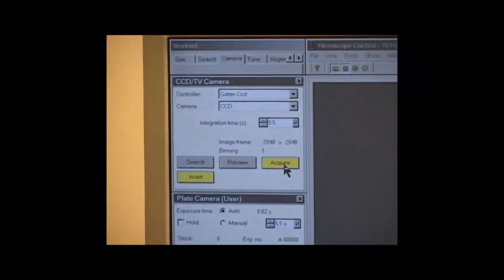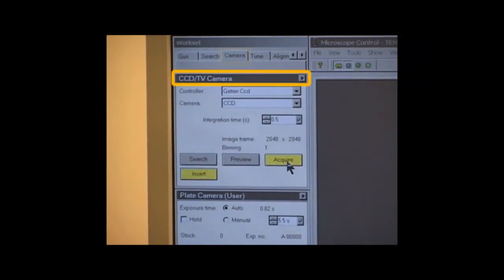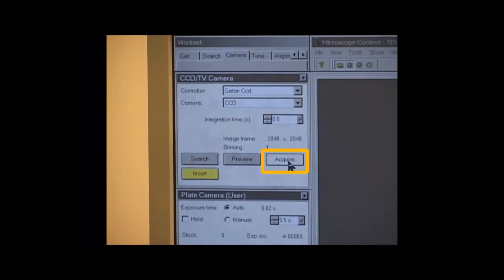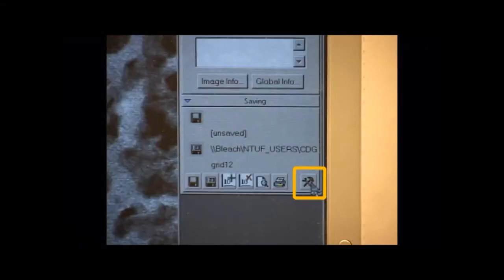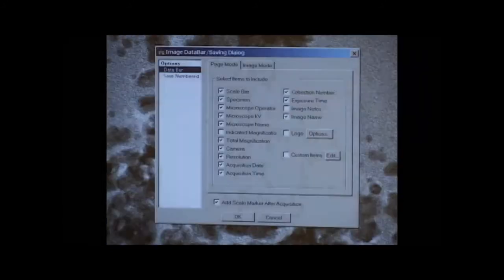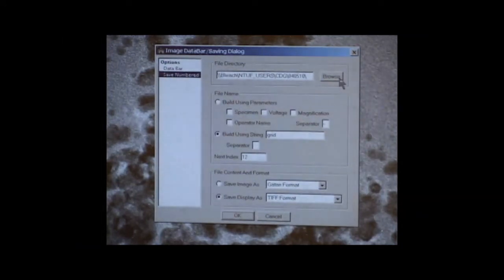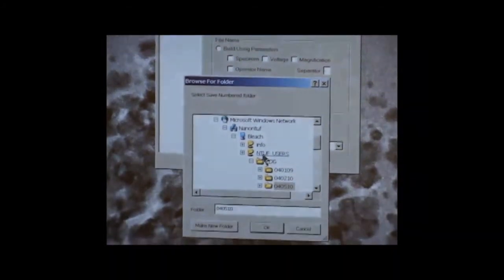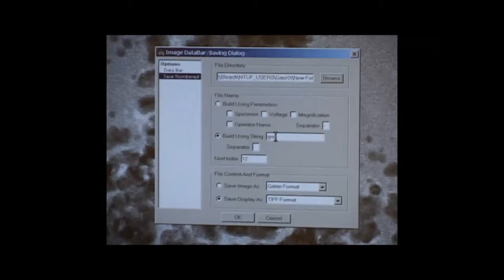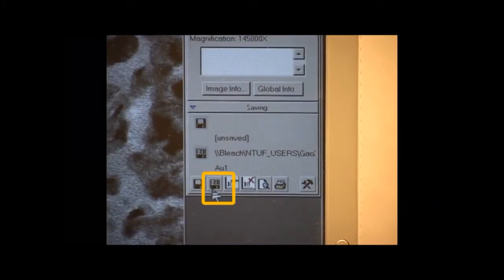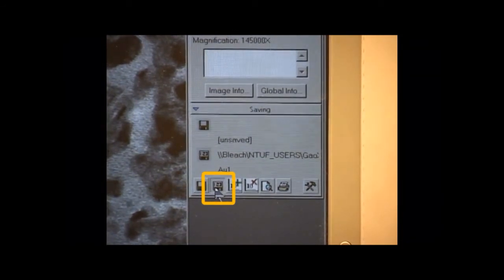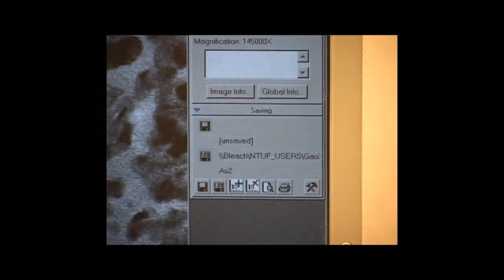Go back to the Microscope Control Software, Camera tab, CCD slash TV, and click Acquire. To save the image in the Digital Microscope, click the tool icon in the lower right. This brings up a new window. Select Save Numbered. Click Browse. Select NTUF Users. Select your folder. In the dialog, select Build Using String, and type in a base file name and an index number. You can choose the default GATAN format, or TIFF, or JPEG formats. The next time you click the 123 icon, it will save the current image using the same file prefix with an incremented number.